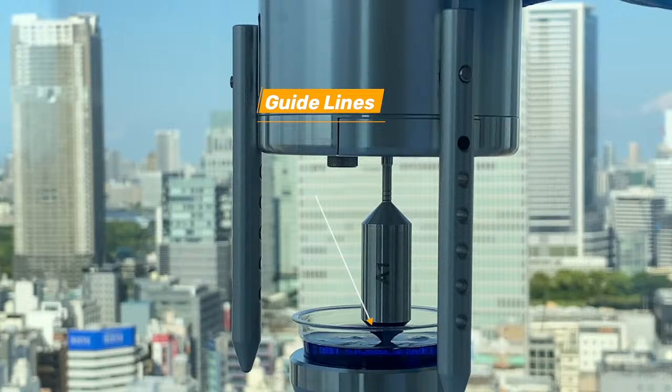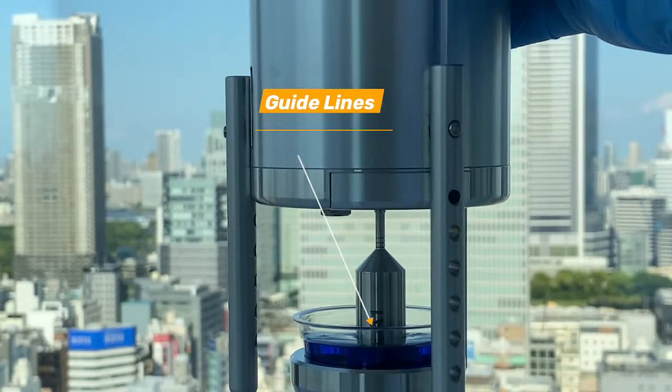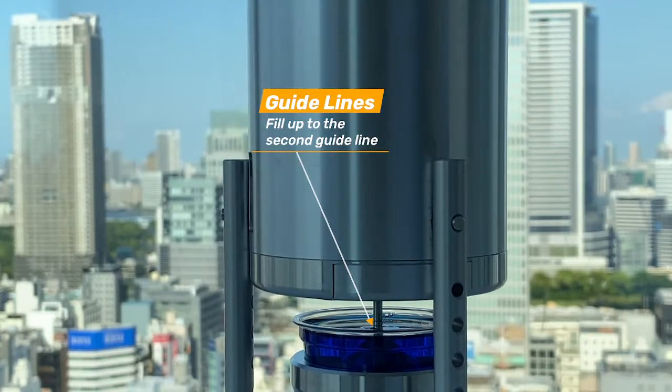And then previously we already chose, we know what the spindle type is, the RPM. So for this particular range of viscosity, we chose the A1 spindle, and we already also chose the volume because the line of the sample should be to the second guideline.